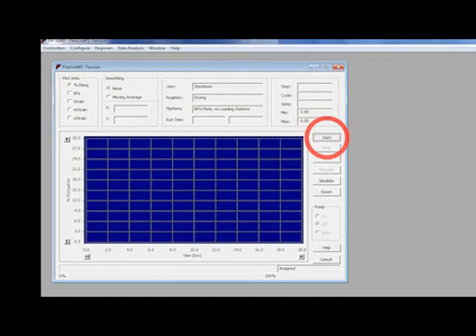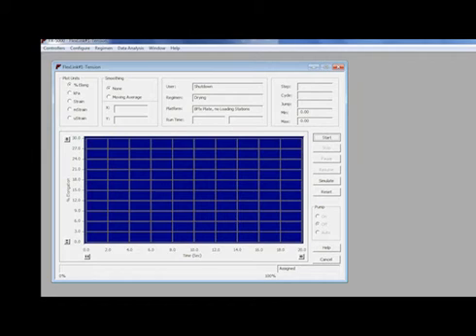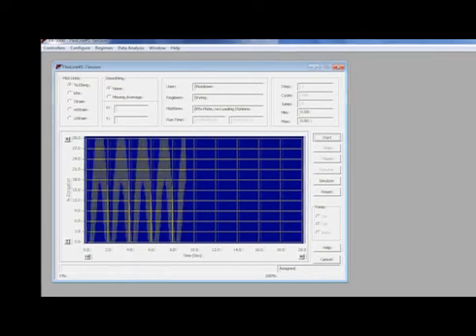To start the regimen, click on the Start button. Be sure that the vacuum source is turned on. The sound of air cycling through the drying filter can be heard.